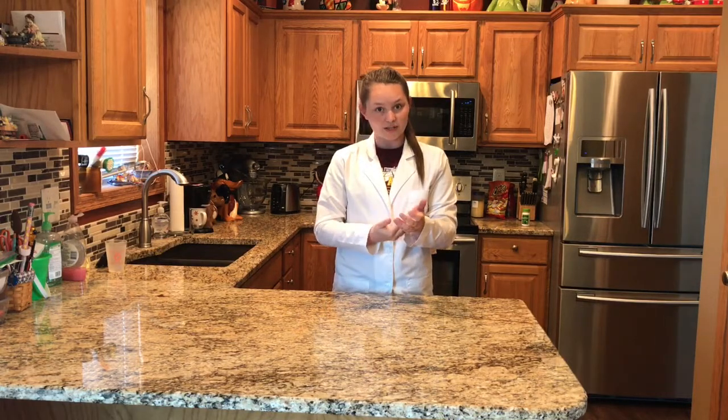Now, let's converse about some other safety topics. If you are to spill something during your experiment, alert the teacher right away to begin the cleanup process. If you are to spill anything onto your clothes or your skin, please report to the nearest washing station located within your lab. Lastly, always make sure to wear long pants to avoid any acid or experiment contact with your skin. Now, let's move on to our next lab scientist tools topic.